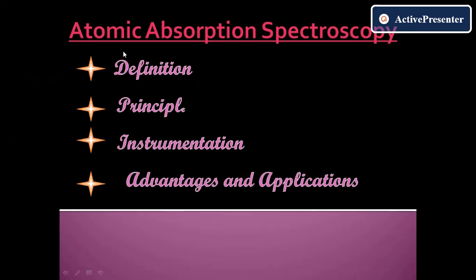Hi everyone, here I am with a new topic called Atomic Absorption Spectroscopy. First is definition, next is principle, next is instrumentation, and next is advantages and applications. First is definition.